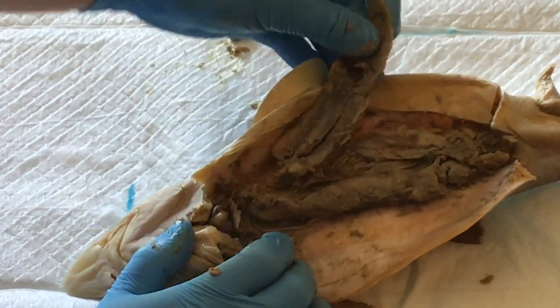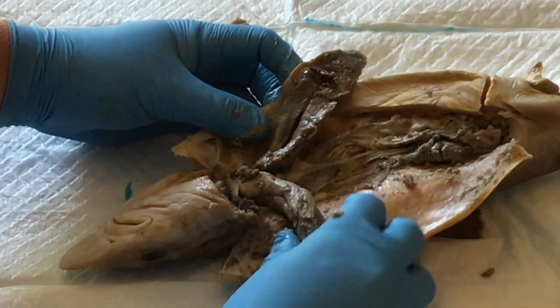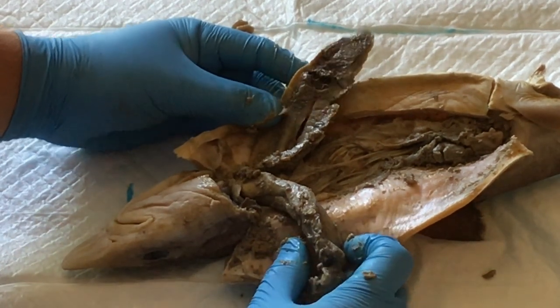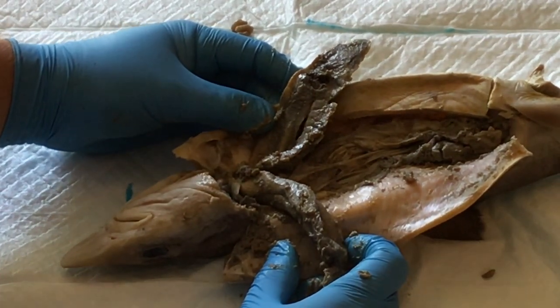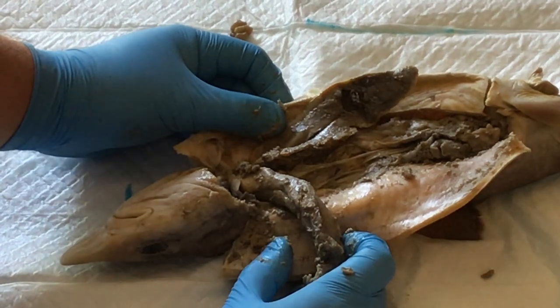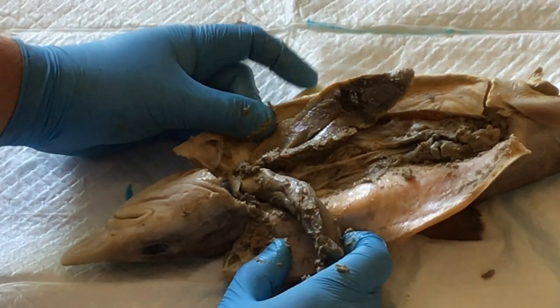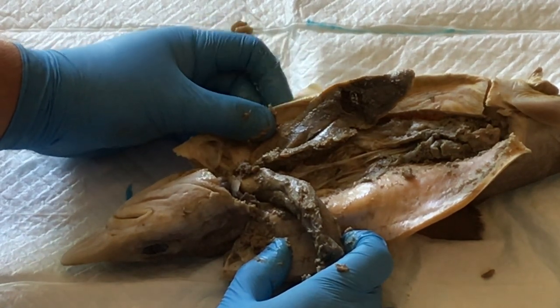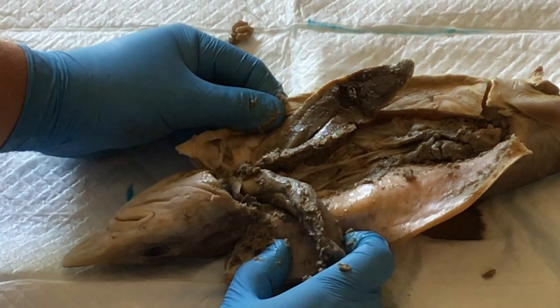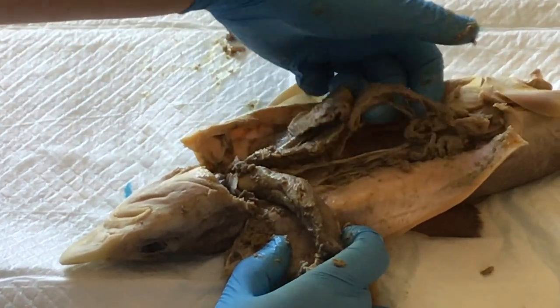The next thing we have is a three-lobed liver. I'm trying to do my best to show you that here as well. This liver here is what sharks use to help them float. Most fish have an internal swim bladder, which helps them to float. Sharks don't. And the way sharks help themselves float without that swim bladder is they secrete oils from their liver. If you think about when we did that little experiment where I mixed all the different liquids together, we had the honey, the syrup, the water, the soap, you name it. The ones that were oils typically floated to the top. And that's how sharks typically get themselves to be buoyant: they secrete those oils and it floats to the top.